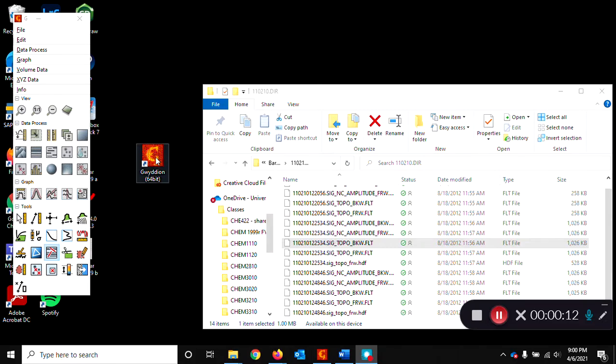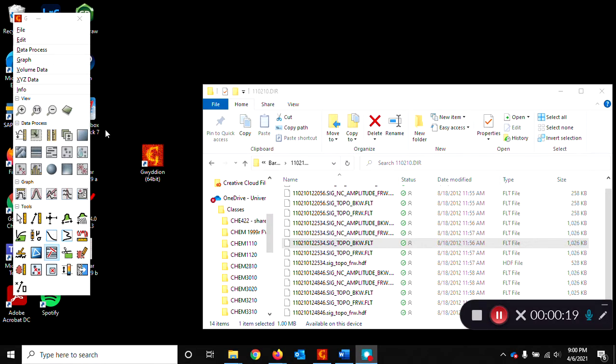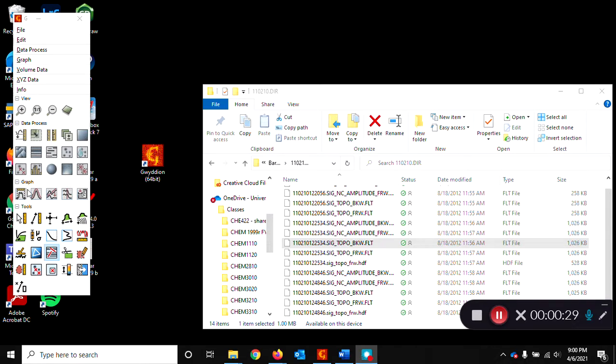First you'll want to double click on the Gwydion icon on the desktop in order to open the software. The control window opens here on the side. You can see it has your normal windows toolbar up here and then a bunch of tools here which are available depending on what your data is.